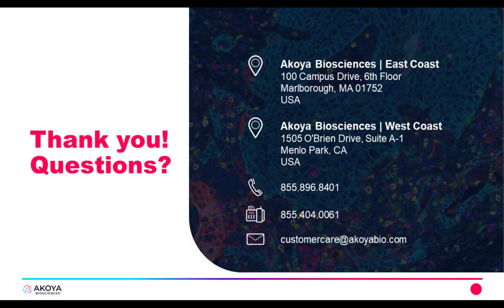How does this platform deal with and overcome autofluorescence? So there are two ways in which we overcome autofluorescence. One way is through background subtraction. Using CODEX, we have the ability to hybridize and dehybridize CODEX reporters. That enables us to run blank cycles, which have no CODEX reporters, only DAPI. That gives us a baseline background, which we can subtract as non-signal to remove autofluorescence. We also have the ability, for FFPE tissue, to use the Cy7 channel instead of the FITC channel to navigate away from that high autofluorescence.